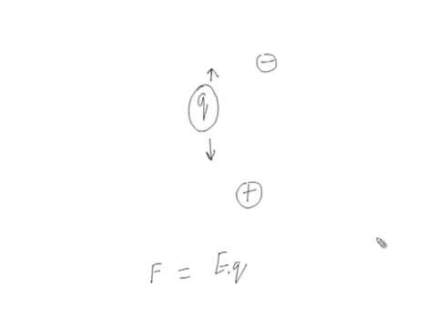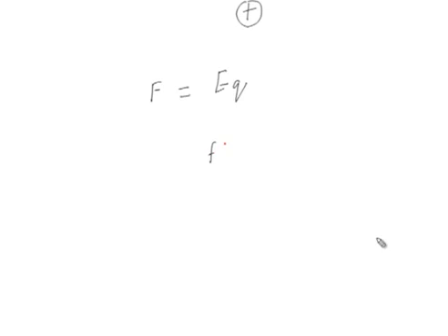Now, there is another force when a particle moves, like we were talking about size and shape here, that is the frictional force. That frictional force will oppose the motion of the particle as it moves through a particular medium. You can also call it a viscous drag, denoted as F. So, the velocity of the particle moving under the influence of the electric field will be given by EQ by F, that is, Vf equals EQ, where F is the viscous drag. After a certain period of time, the forward moving force EQ equals the viscous drag, which depends on the velocity of the molecules, that is, Vf.